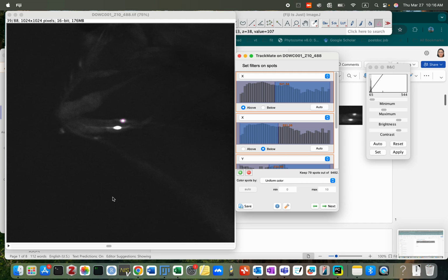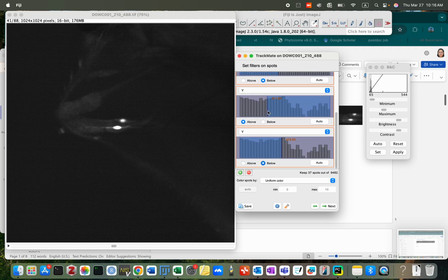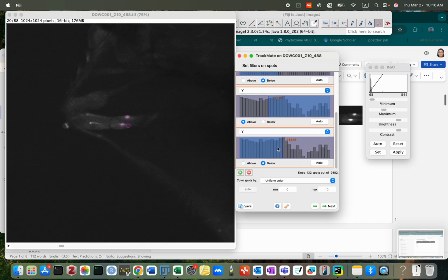Oh, you see here, because of the filter setting, I'm losing very important time points. So I need to find it. Not X, then it is Y. Let's see. No. Okay, now I see it. You need to play with this filter until you think that's the best you can do. If some extra circles are still showing, then we can delete them in the Excel.